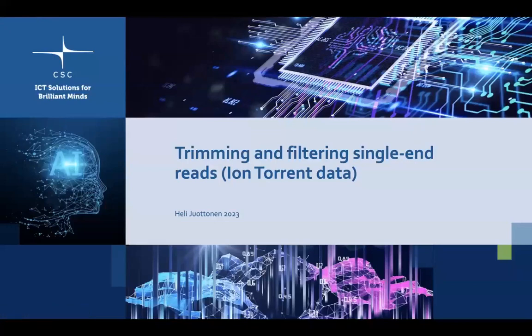In this video, we will cover how to trim and filter single-end sequence data in Chipster, focusing on ion torrent data.